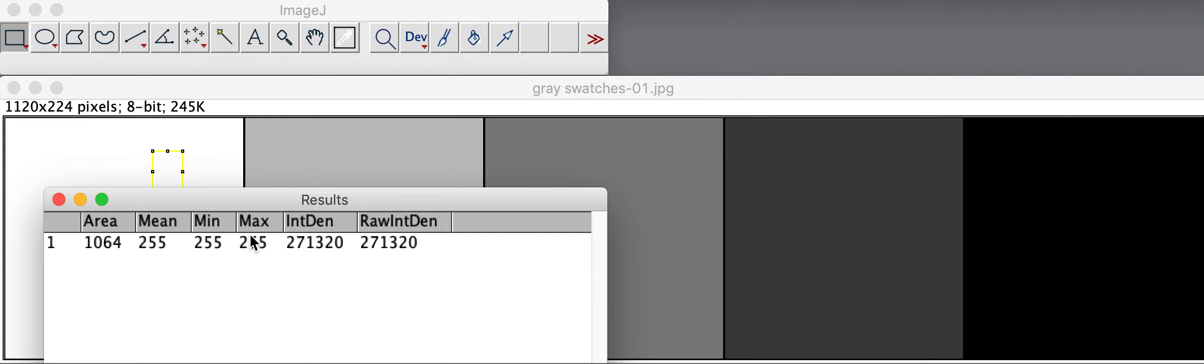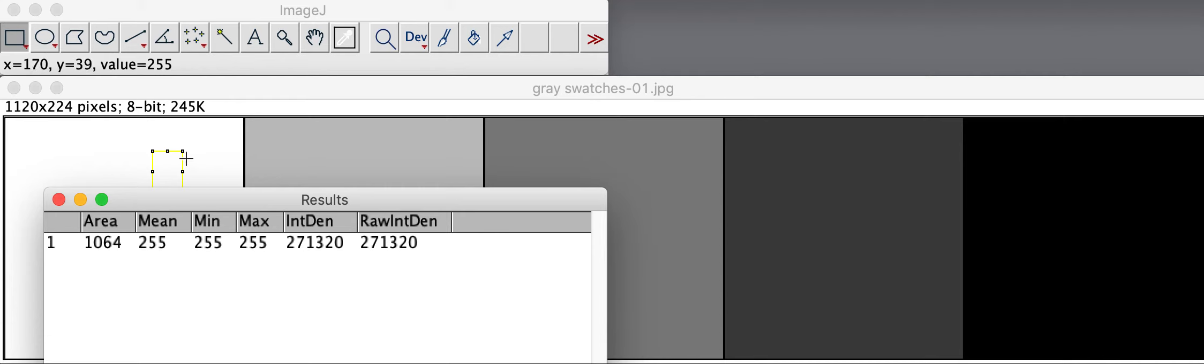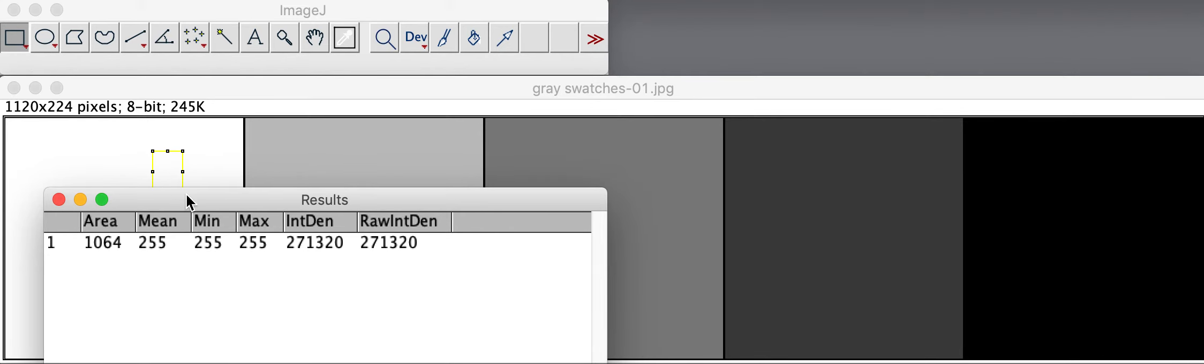What we're interested in here is the integrated density. That's sort of the average color of the square, not focusing on an individual pixel, but in general, based on the area of the square and the density of all of the pixels inside that square.